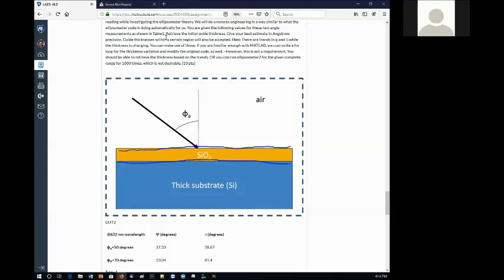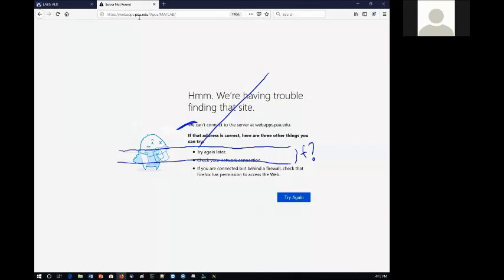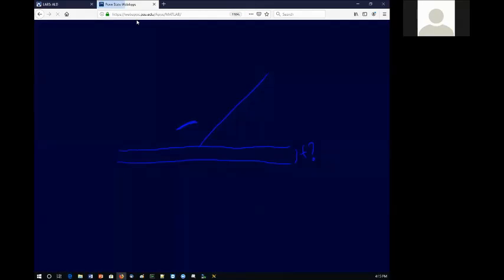Okay, can you guys see me? So this is a little thicker than usual. So we have a certain thickness of an oxide here right now that I'm trying to figure out with, again, ellipsometer with some incident angle. You guys will use the software that I gave you again, so don't worry. I'm trying to understand how much of a thickness I have, so we will use ellipsometer too.